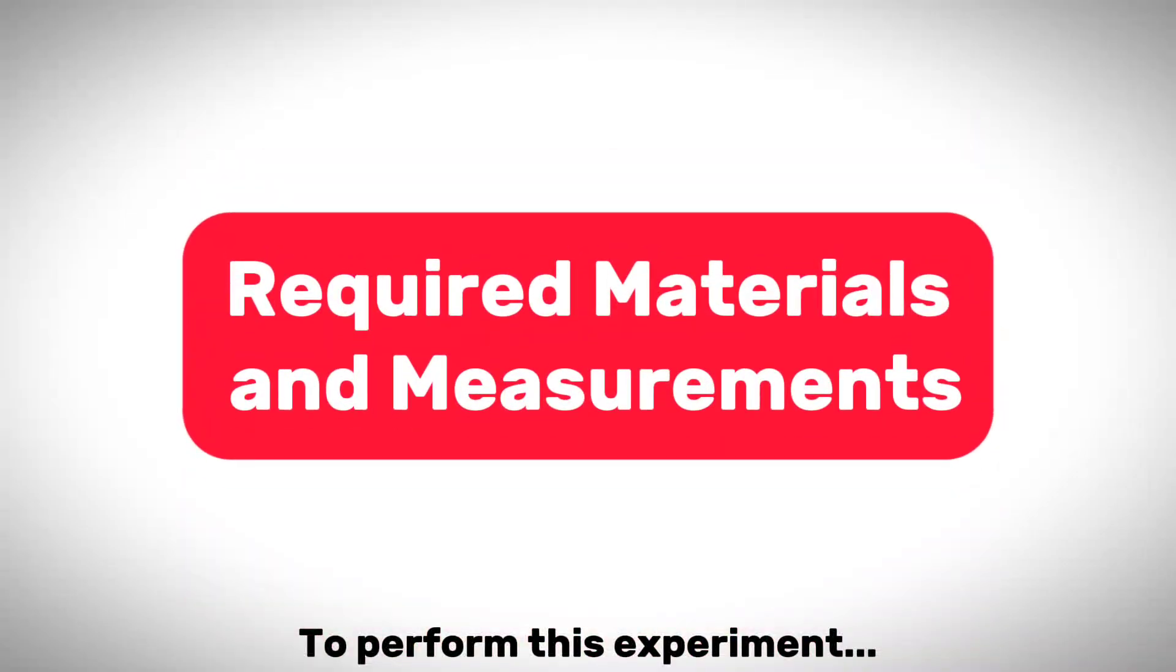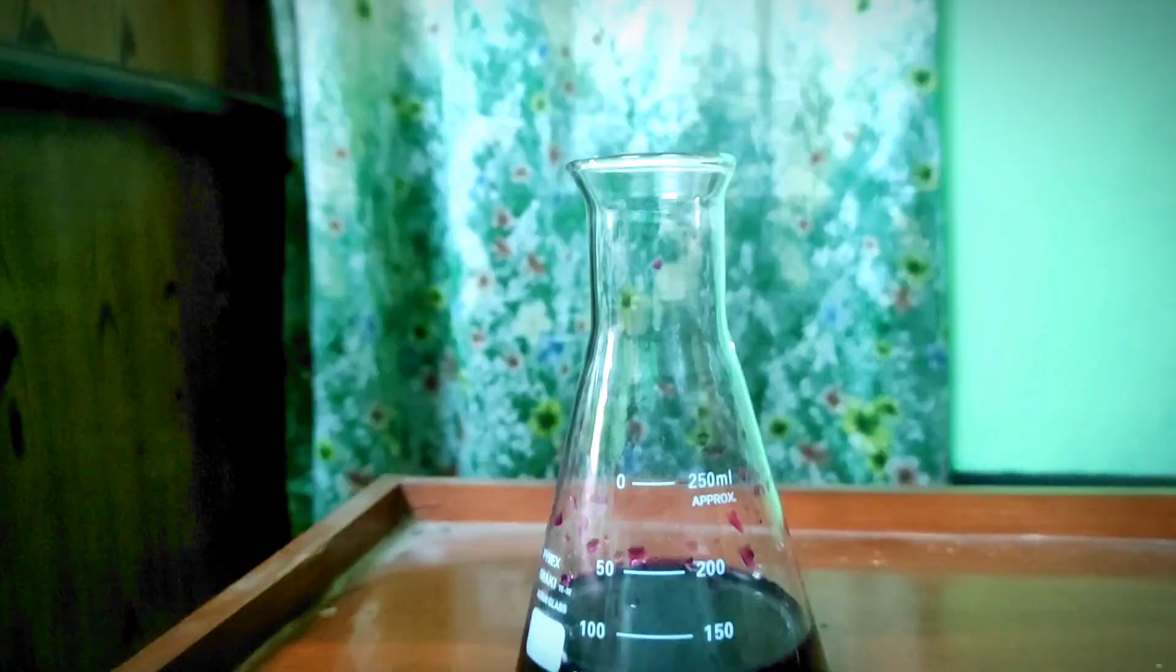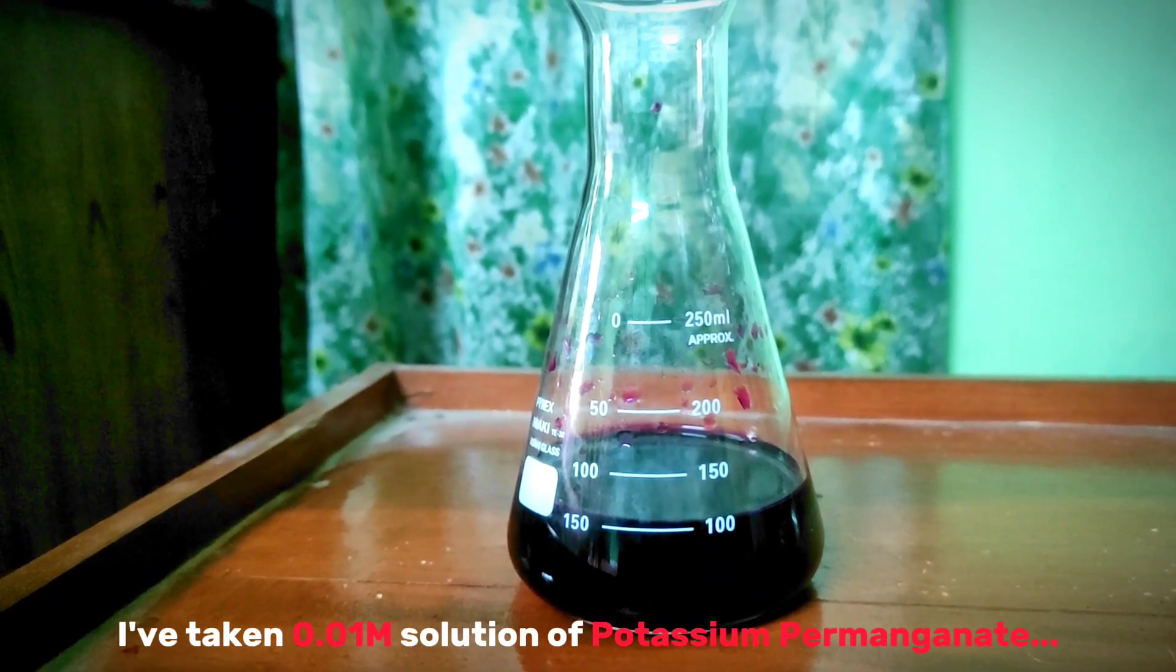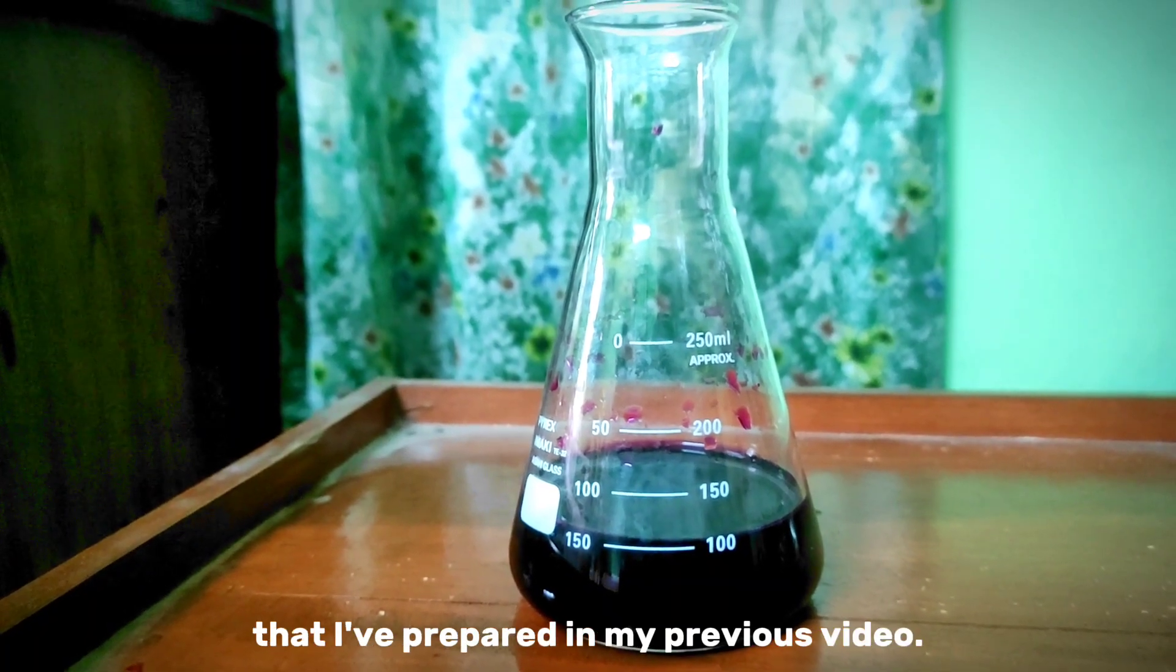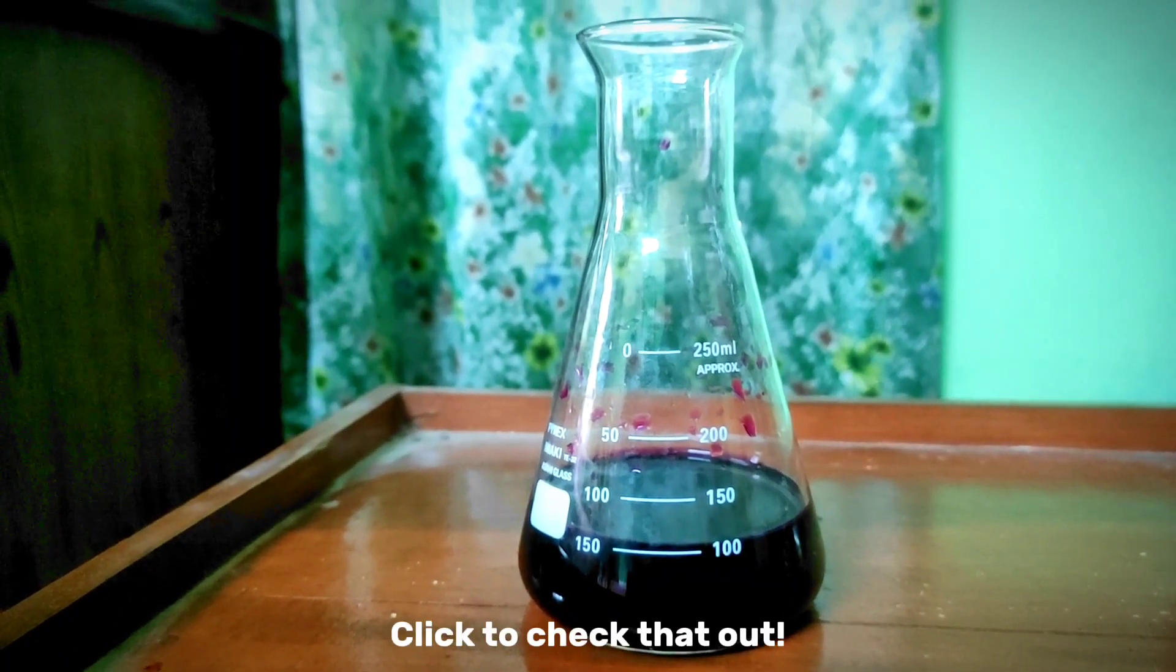To perform this experiment, you will need the following materials and measurements. Here in the conical flask, I've taken 0.01 molar solution of potassium permanganate that I've prepared in my previous video. The eye button has already arrived. Click to check that out.